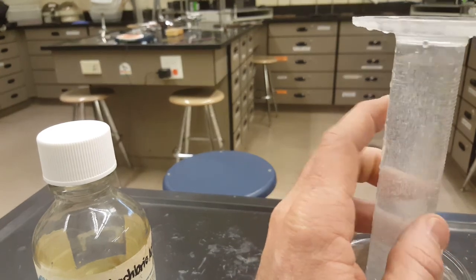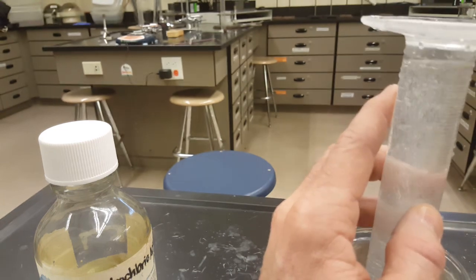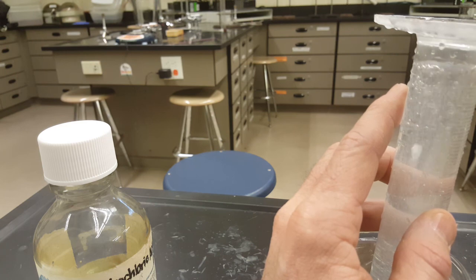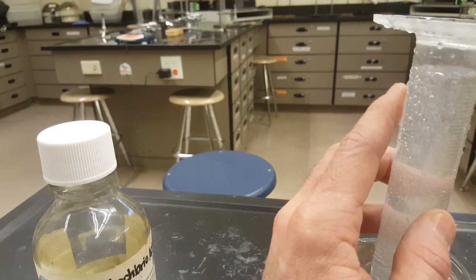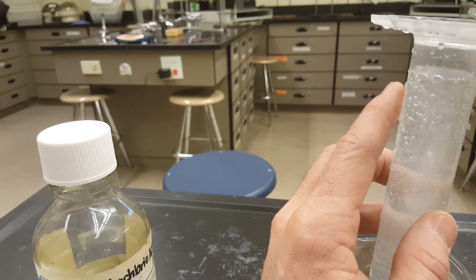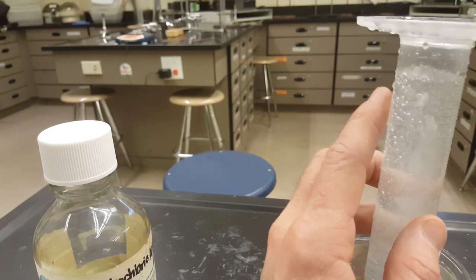And you roll the numbers around, and it looks like about 3 milliliters. I'm going to say 3.0 milliliters. I'll mark the spot. That is the air that snuck in. That's going to contribute to my error later.